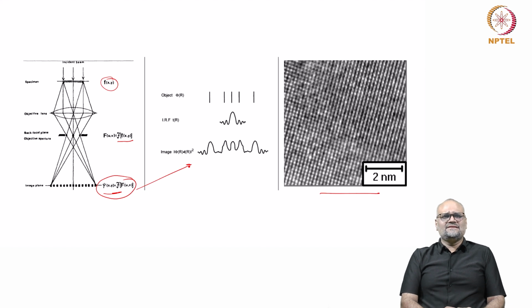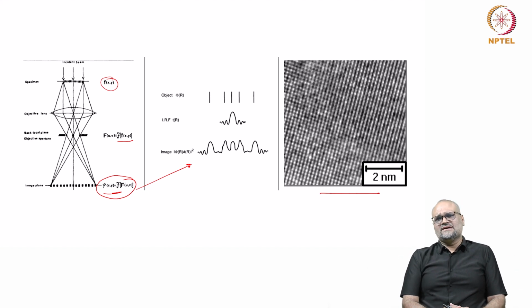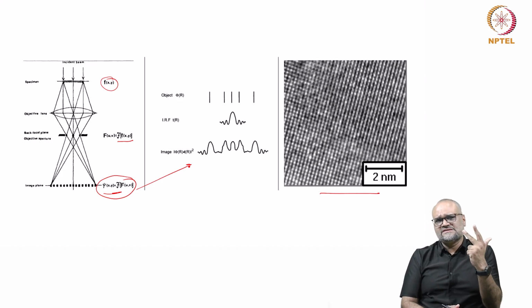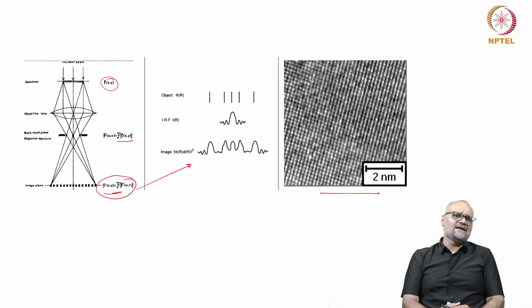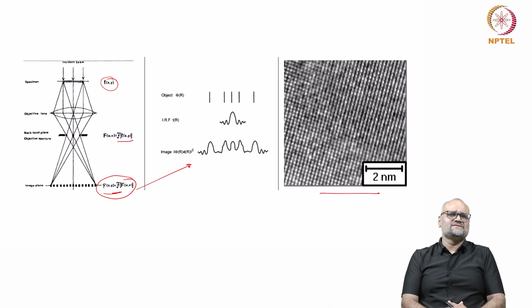If you remember the structure problem, we defined it as a threefold problem. I know the unit cell parameters, I know the symmetry, and I know the position of the atom. And when I introduced this concept, I told you that the position of the atom can be obtained by the exit wave reconstruction through a through focus series.